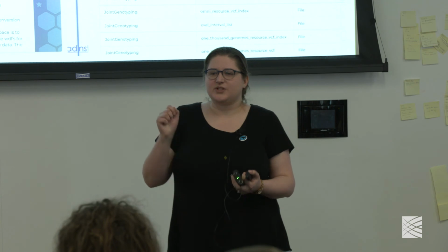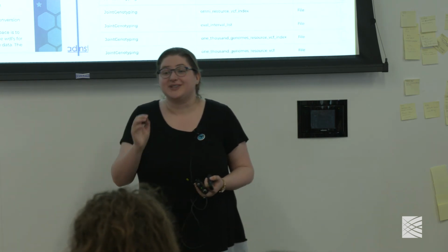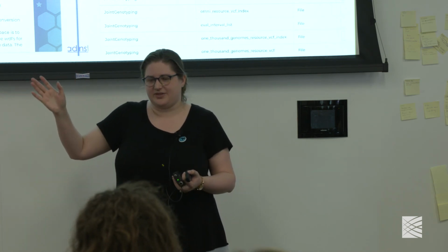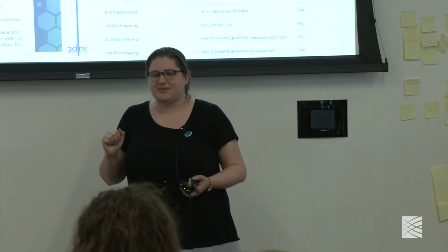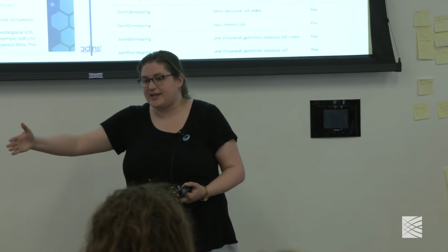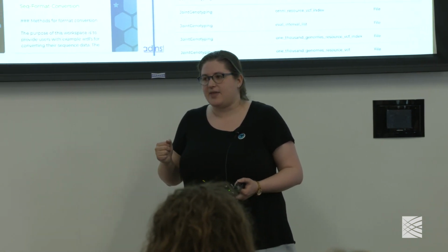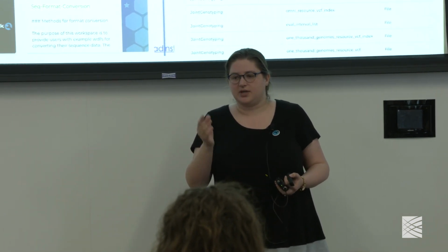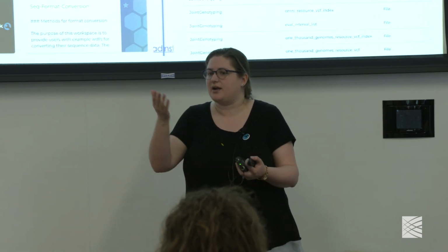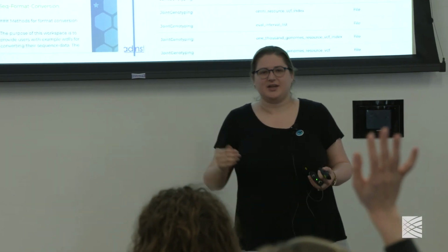Yes. So the question was, how do we assess quality of our final VCF outputs? And we're going to go into a lot of detail on that for germline tomorrow, and then for somatic on day 3. So I don't want to get into the nitty-gritty, but there are definitely ways across your whole sample. There's QC metrics. Across a cohort, there's QC metrics. And then we're also going to look at how you can make plots from your VCF of those annotations in Terra or something like that. And so we'll definitely get into that. It's a big question.